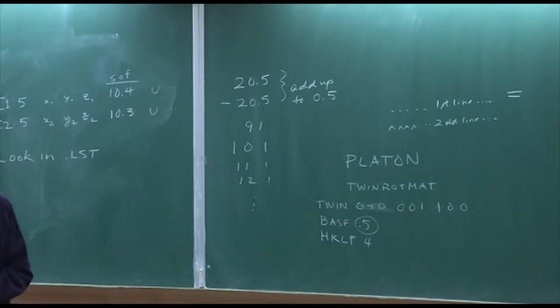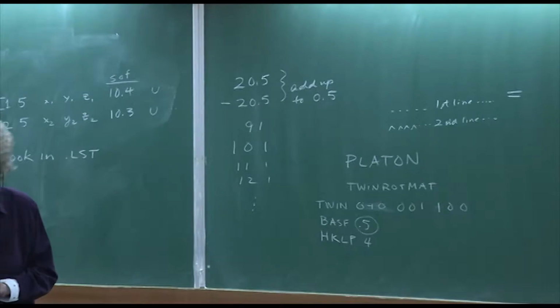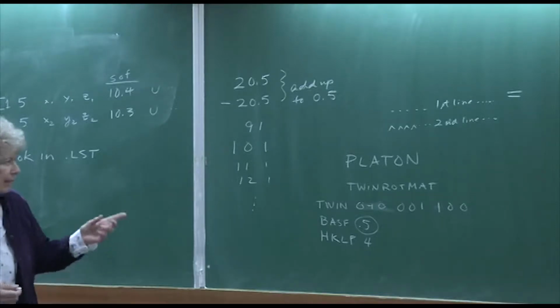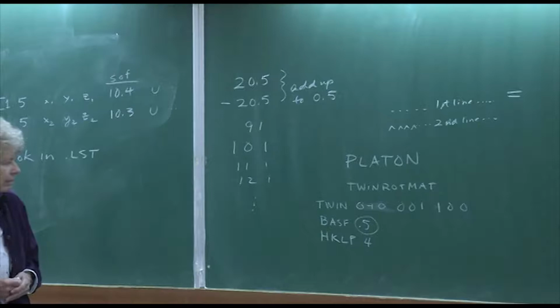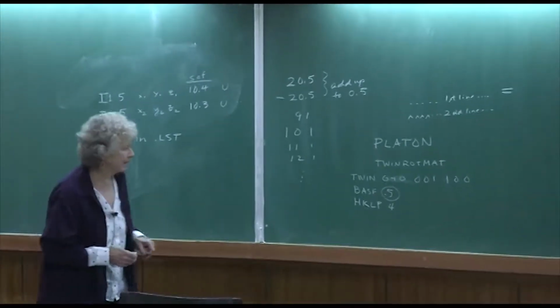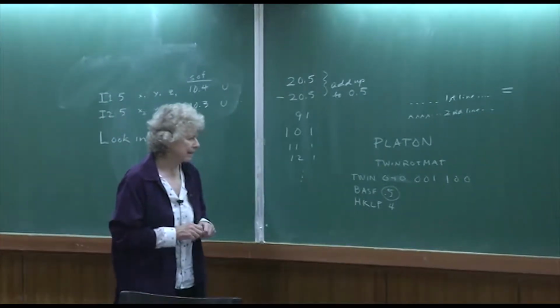You'll notice too, if you do a CIF check when there's twinning, some of the messages will say this doesn't apply because it's twinned, because some things can look funny with twins. Sometimes you can actually figure it out yourself by just looking at the structure, but that's harder. It's easier to just do it by asking.